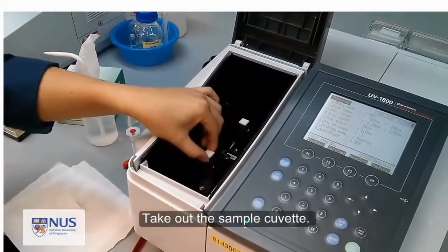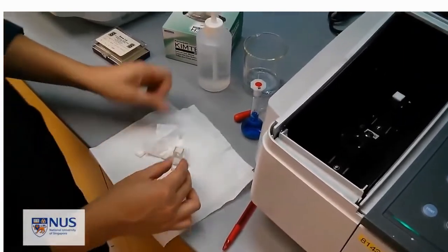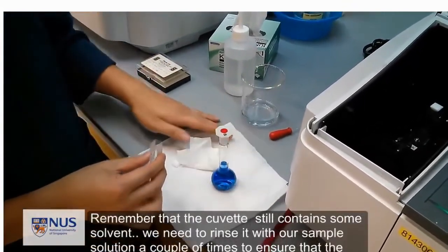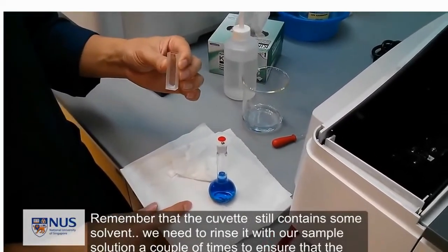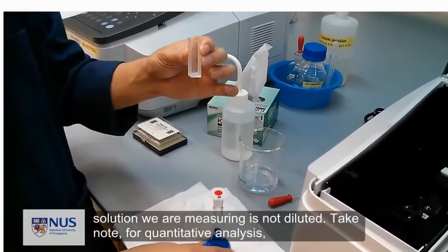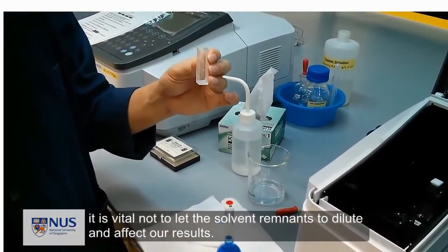Take out the sample cuvette. Discard the solution, and we are ready to run our sample solution. Remember that the cuvette still contains some solvent. We need to rinse it again with our sample solution a couple of times to ensure that the solution we are measuring is not diluted. Take note, for quantitative analysis, it is vital not to let solvent remnants dilute and affect our results.